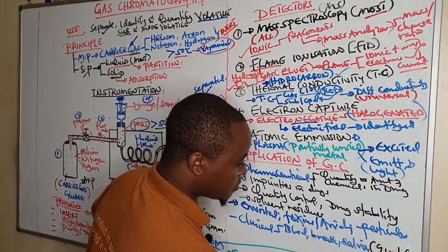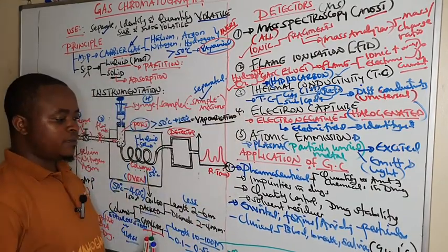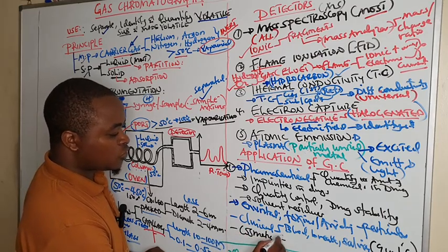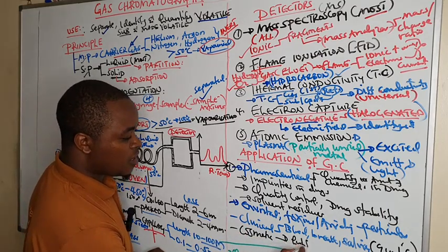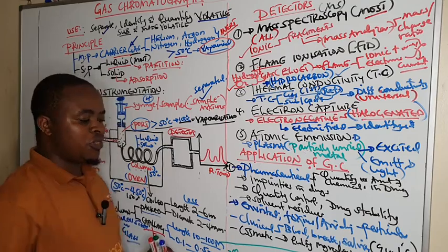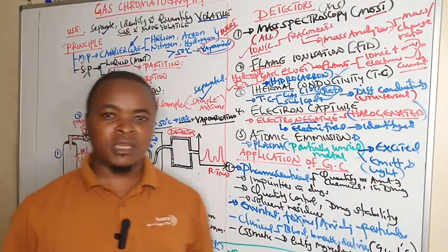using gas chromatography. Then in the cosmetic industries, we are also using it to quantify different ingredients within the products which are being produced.